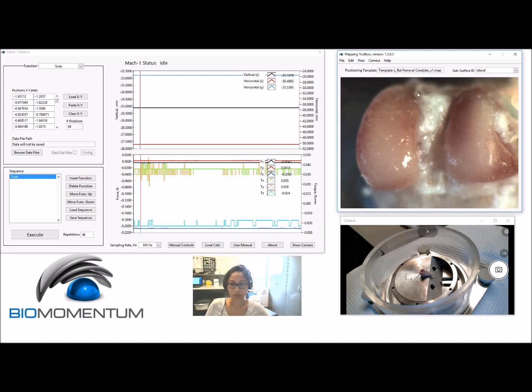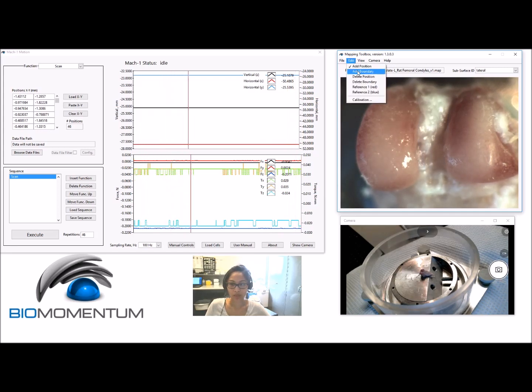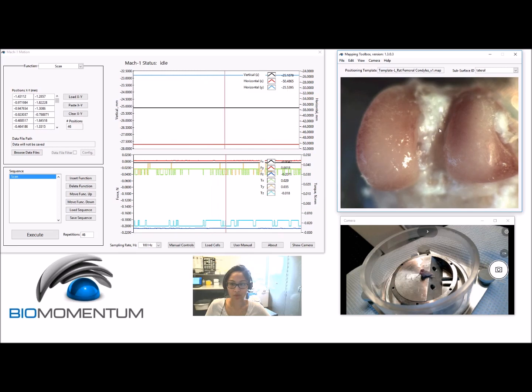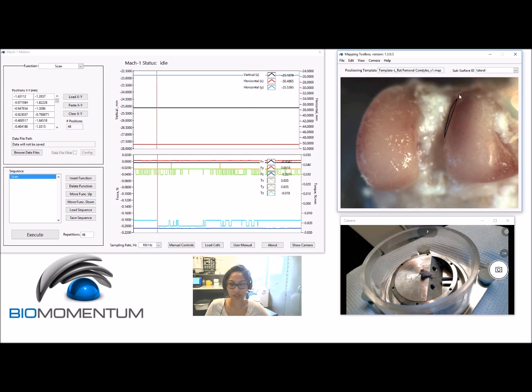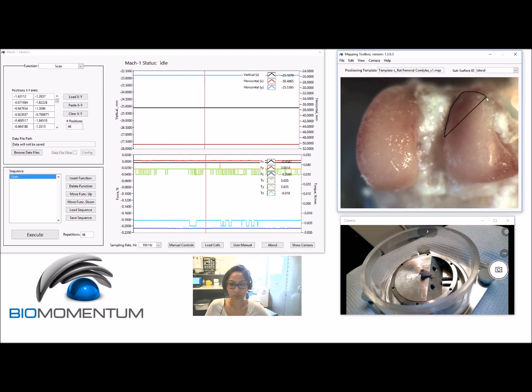The positioning template can be deleted. Choose Add Boundary and click in the camera feed to define the boundary along the sample subsurface, and a closed contour will be created.